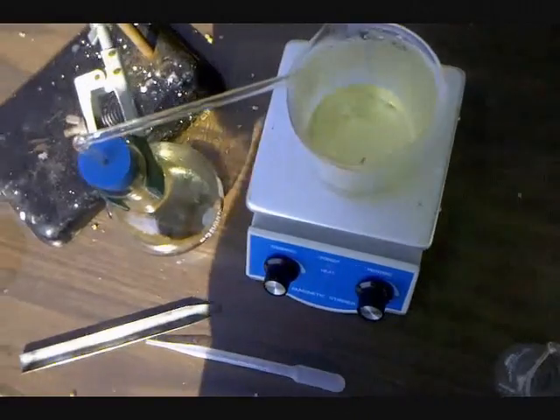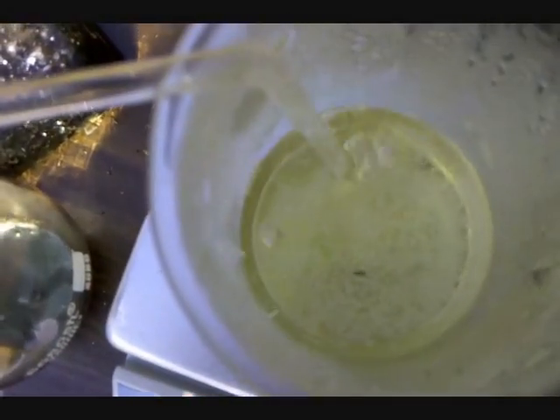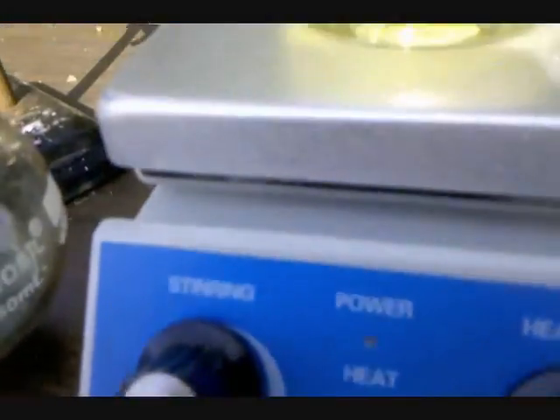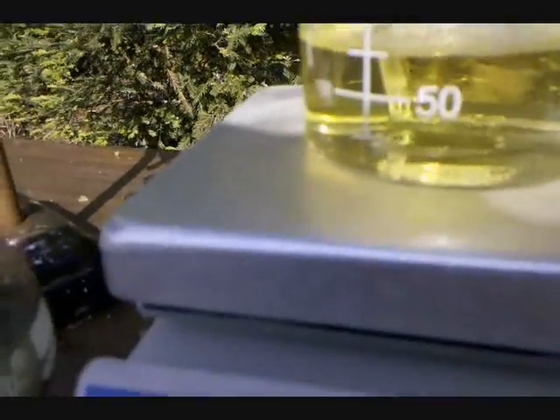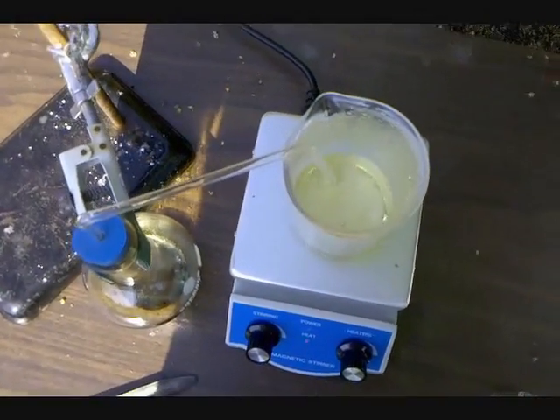It's been about 25-30 minutes, and we can see a precipitate of potassium periodate floating on the top of the liquid and a few crystals on the bottom. I'd say we're about halfway done. I'm going to leave it for an hour and get back.